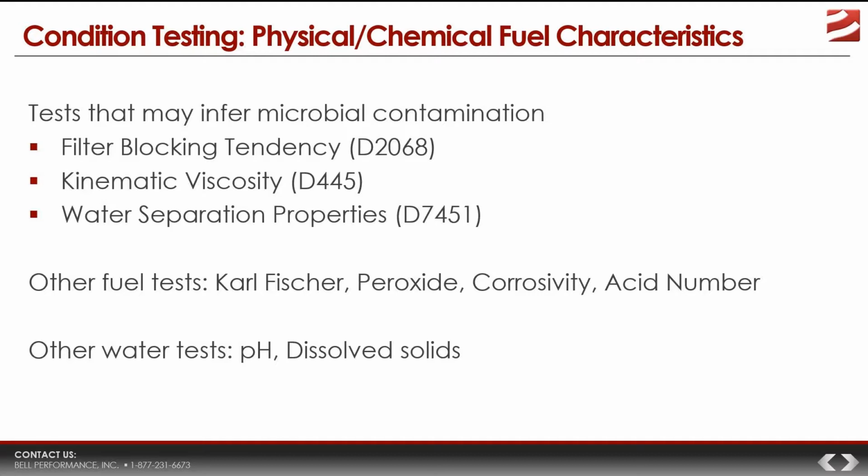Well, we've got three on there. There's a filter blocking tendency test, D2068. This helps determine the particulate load of a fuel, and if you've got a microbial contamination, the fuel by nature is going to have a higher particulate load. Hence, D2068 possibly infers microbial contamination.